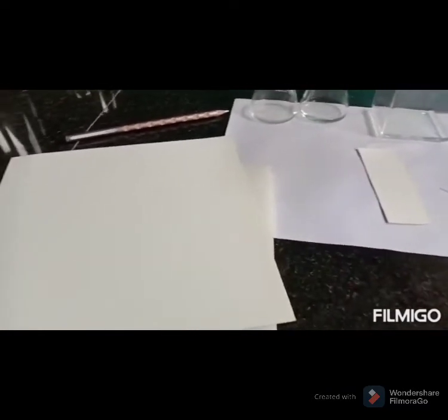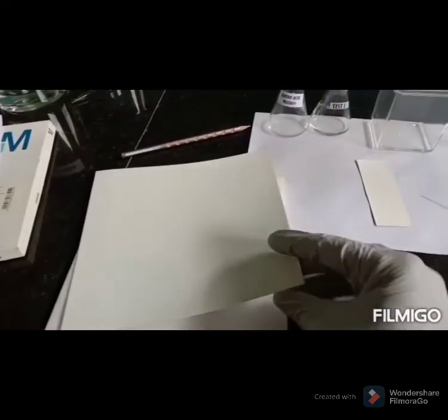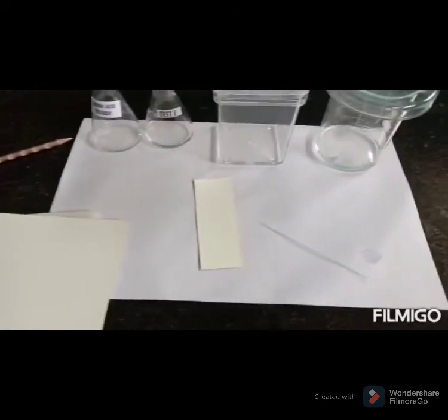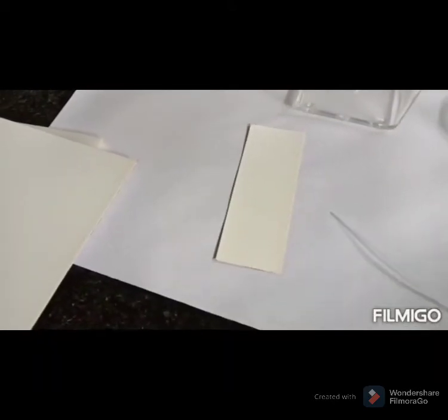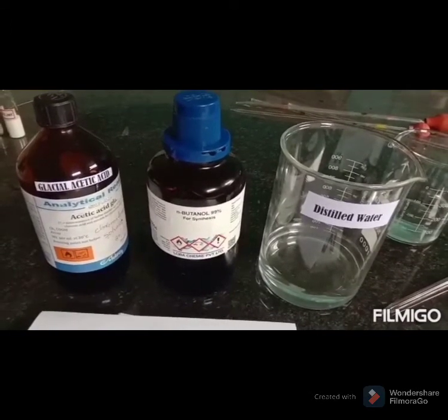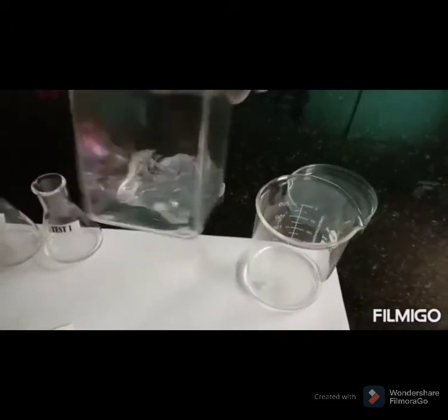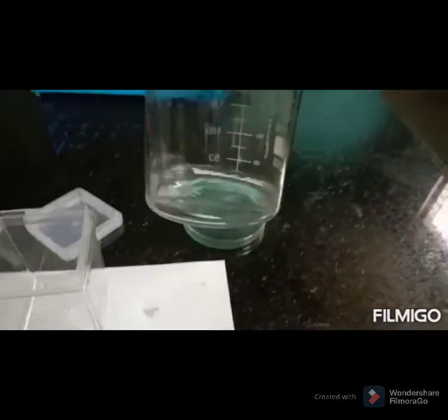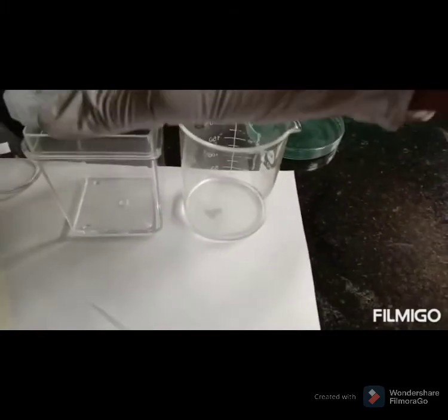It is prepared from silica gel and calcium sulfate in acetate buffer, spread on a clean glass plate, dried and activated at 110 degrees Celsius for around 1 hour in an oven. In any case, the TLC plate should ideally be 5 centimeters wide and 15 centimeters long. The solvent mixture, butanol, acetic acid, water, is added to the chromatography chamber, which has to be kept closed for some time for vapor saturation inside it. We have taken two types of chambers here. You can use whichever is convenient.